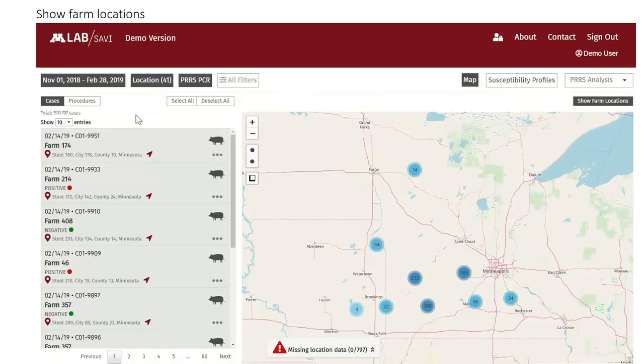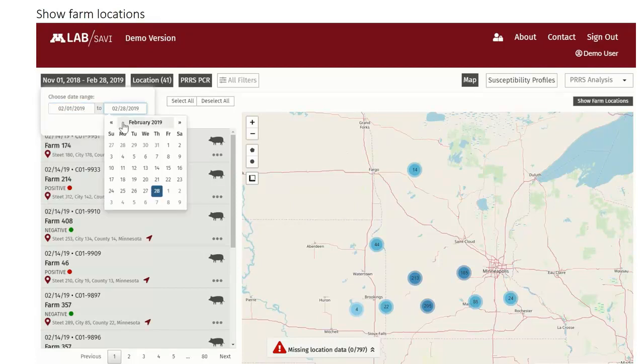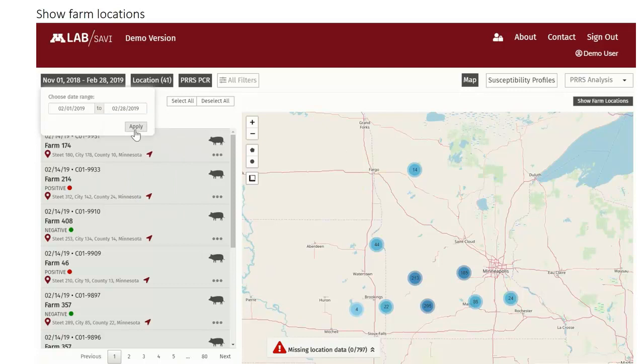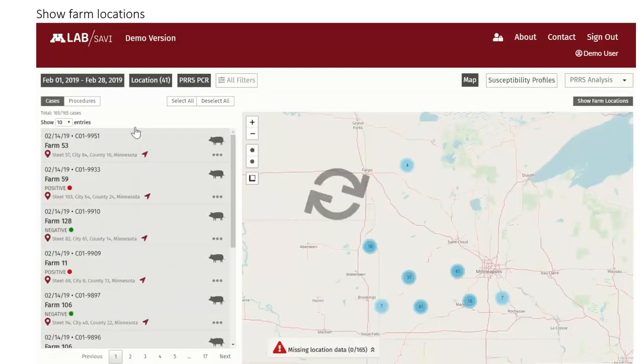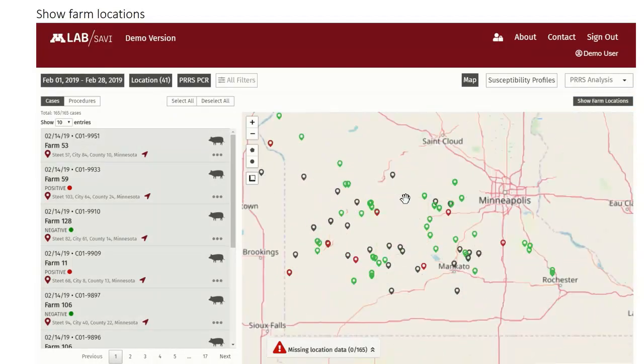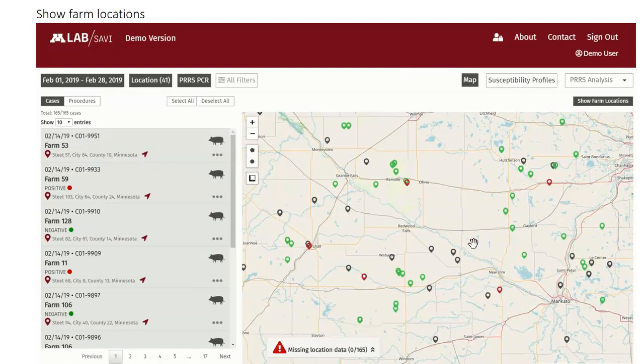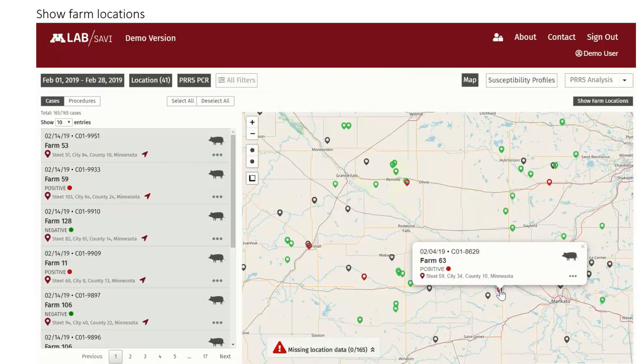Okay, so then we can look at farm locations. Again, set your parameters. Maybe you just want to know what farms have I sampled recently, and so you define a narrow scope of dates and see which farms you've actually had samples or screening or monitoring done, and so this is a way to have that represented graphically. And again, the color scheme gives you an indication of the testing results just for that defined period. So it's a way to filter and look, and again, look up cases. I think you're getting the idea here on how to navigate around.